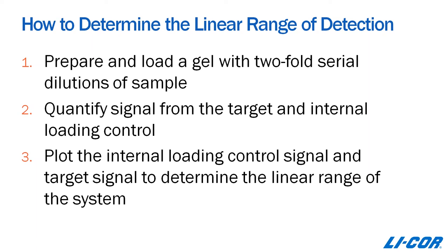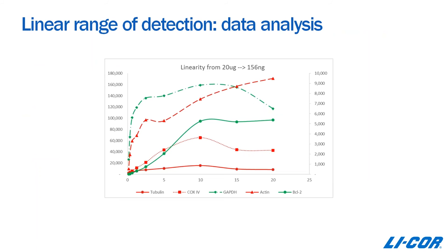Here's an example using actual data. The target is BCL2, which is involved in apoptosis, and we evaluated four different housekeeping proteins along with the target. As the amount of lysate increases, the target signal looks linear to about 10 micrograms. However, several of the housekeeping proteins fall apart pretty quickly. In this particular system, you get a pretty linear response for COX4, tubulin, and the target at about five micrograms of lysate. Based on this, that would be a good starting point to begin your experimental analysis.